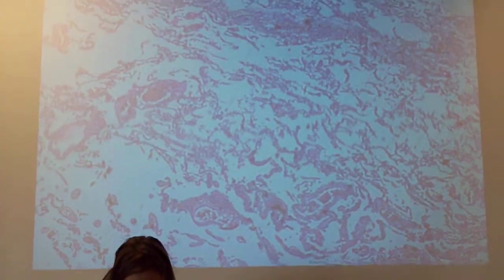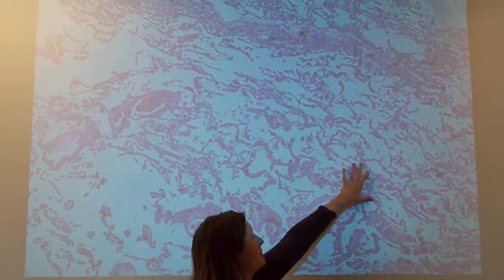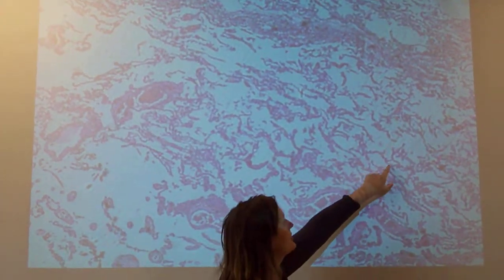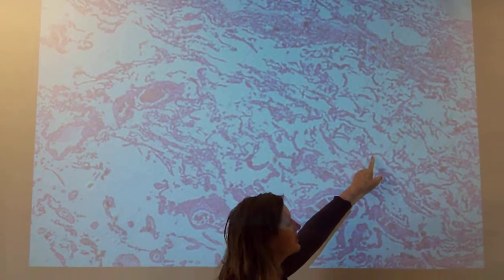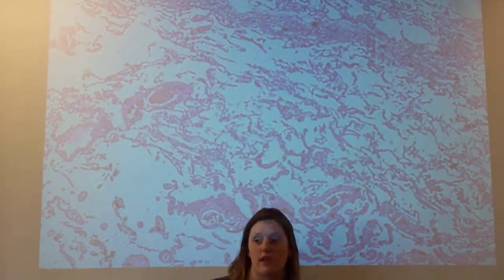So all of this stuff that looks like kind of splotches in the sea, all of these are alveoli. The reason they look like that is they're just one cell layer thick. They're all white.